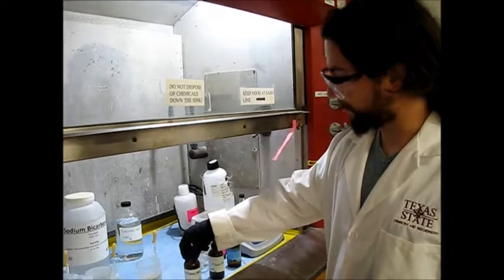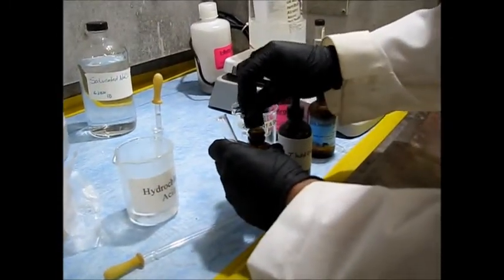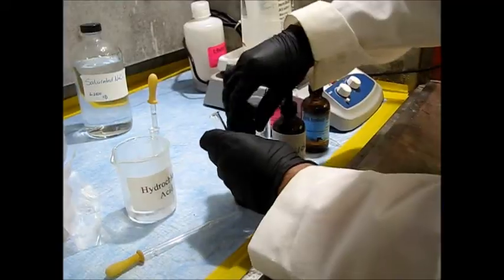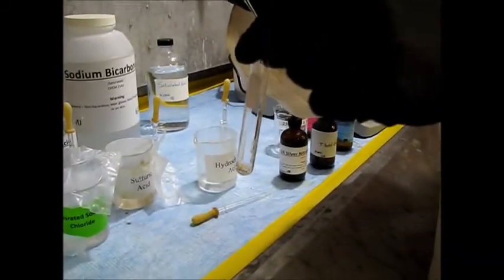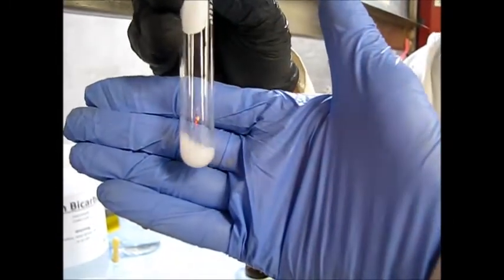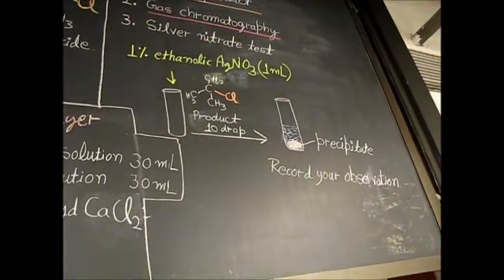Now we perform the silver nitrate test. Take one percent silver nitrate in ethanol and pipette about one milliliter into a test tube. Then add about 10 drops of the product, tert-butyl chloride. Immediately you can see a white precipitate forming — this confirms a successful reaction. We have obtained tert-butyl chloride confirmed by the formation of the white silver chloride precipitate.